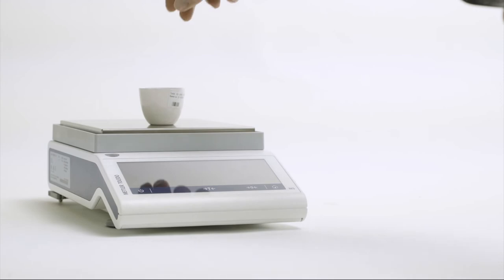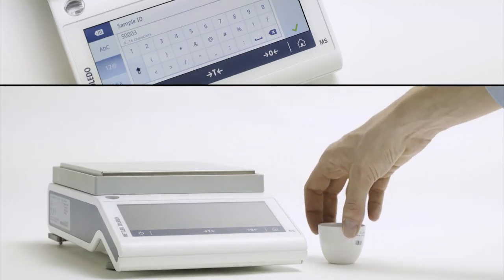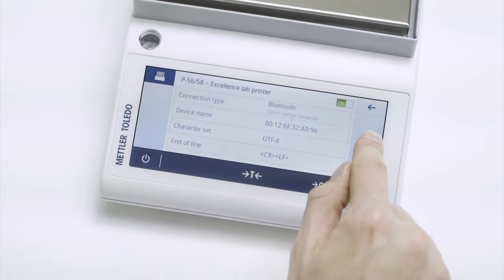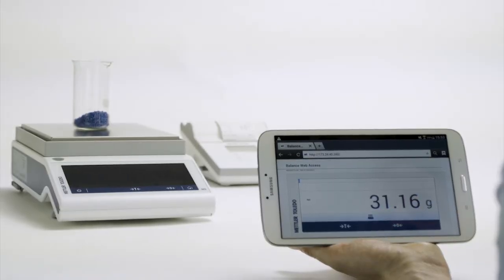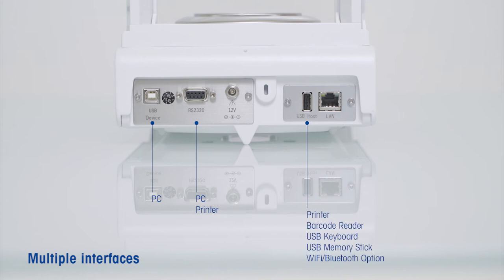The need for connecting laboratory equipment to PCs or interconnecting balances to other laboratory instruments is constantly increasing. For this reason, MSTS balances are equipped with built-in state-of-the-art communication interfaces. One RS-232 interface is integrated. In addition, there are two USB interfaces for connecting the balance to a PC and for connecting peripheral devices such as a printer or a barcode reader.